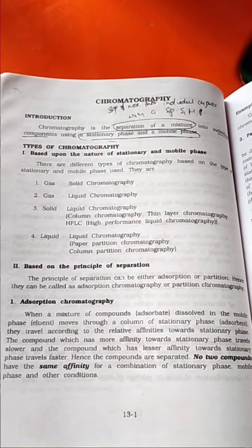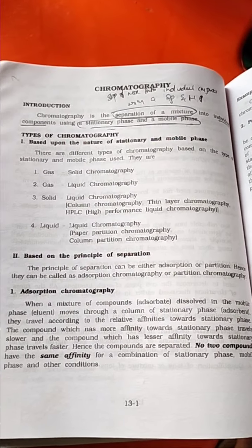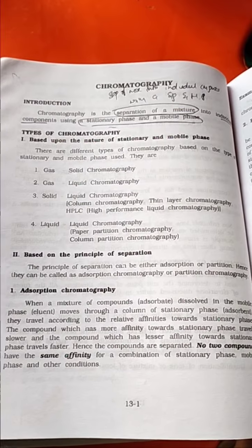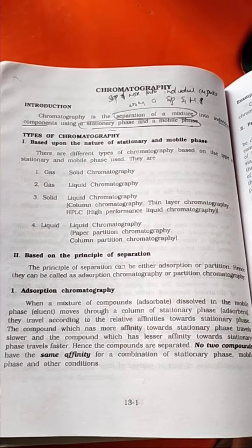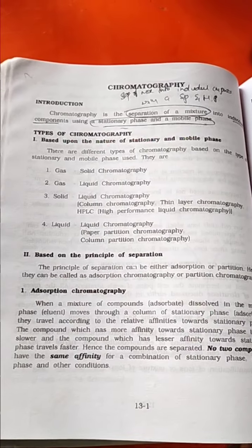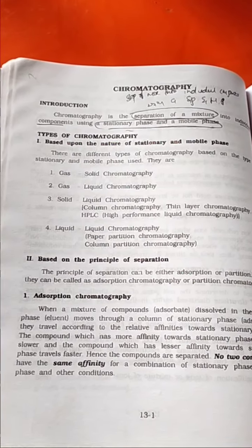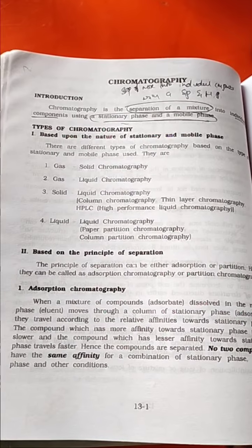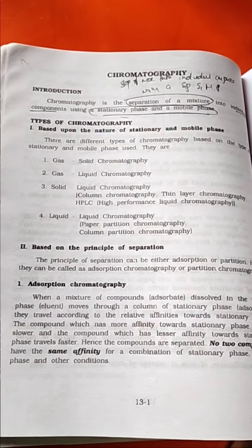No two compounds have the same affinity, because each compound has a different affinity by its molecular size, and it changes with the combination of stationary phase, mobile phase and other conditions. Examples of adsorption separation are gas solid chromatography, thin layer chromatography, column chromatography, and high performance liquid chromatography. And now comes partition chromatography.